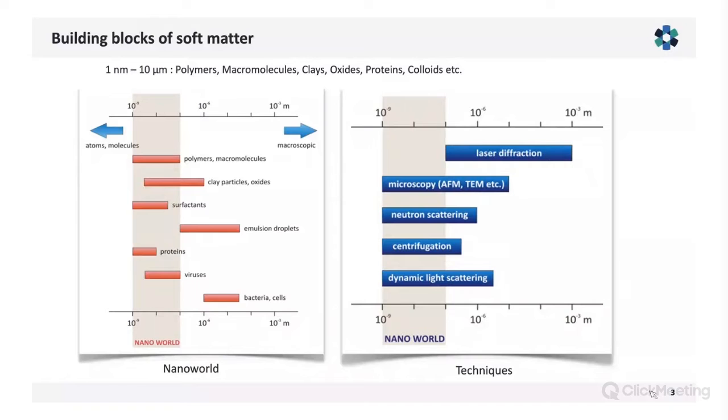And there's not all that much in terms of methods that you can use to characterize these systems. There are techniques like electron microscopy or atomic force microscopy that are very time consuming and expensive. And then you have neutron scattering, and therefore dynamic light scattering and also static light scattering have become really the tools of choice in many laboratories to study this type of systems, in particular particle sizes and interactions, and also sometimes the shape of the particles if you think about depolarized light scattering.